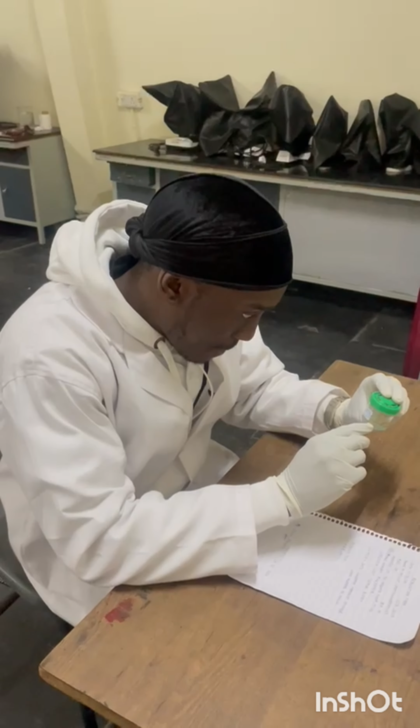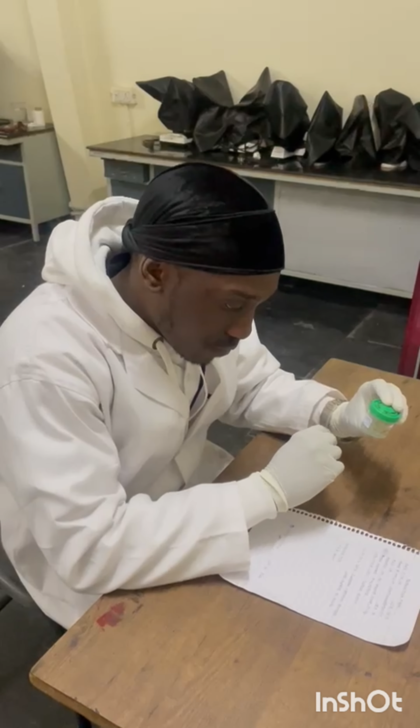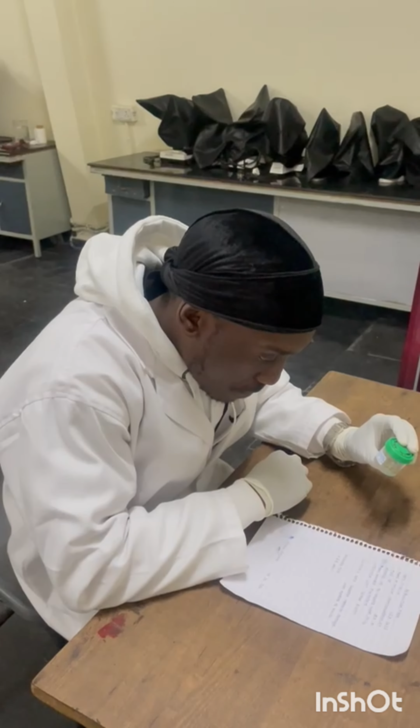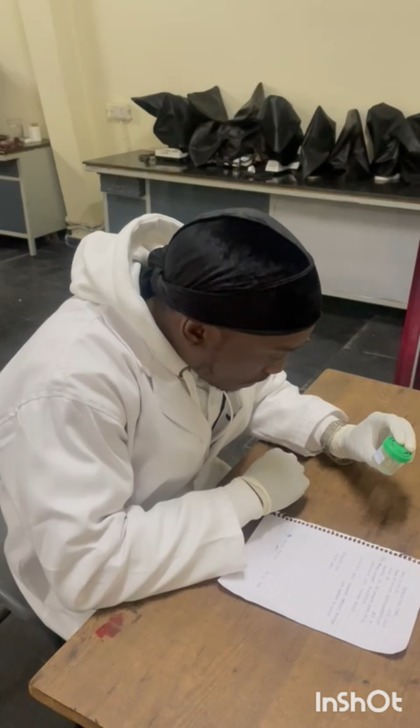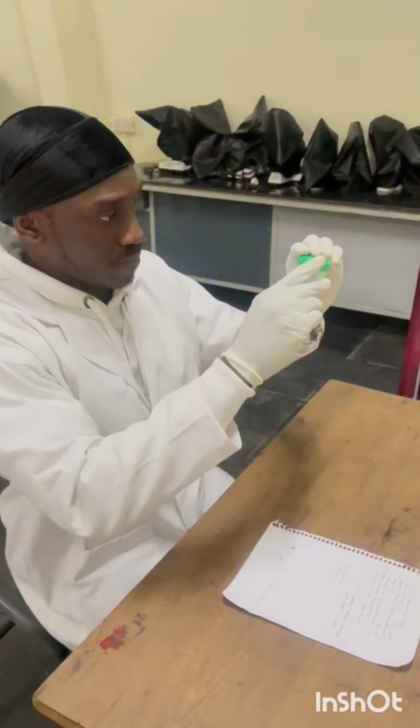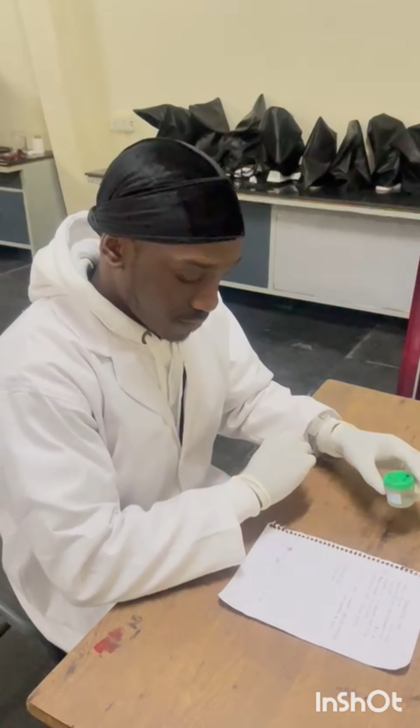We also have to label the sample with a unique identifier. This is a unique identification number and other relevant information. We also have to store the sample in a secure, controlled environment, such as a refrigerator or freezer, when this is required.